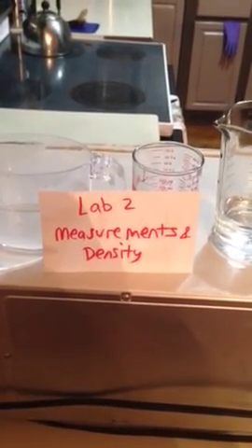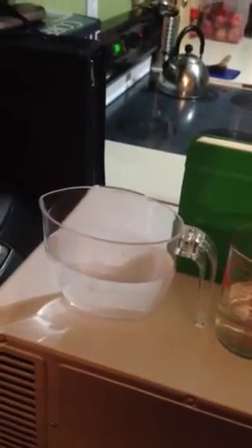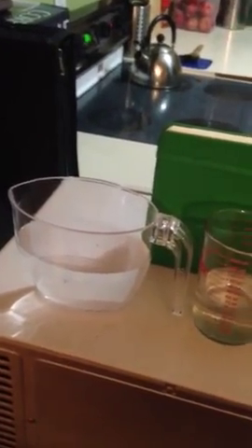Now part 2 of lab number 2 is determining volumes of water in 3 different measuring devices. So you're going to either randomly fill your containers or have someone that is near you fill the containers, not all the way, but somewhere within the measuring range. And you're going to look at each and take your best measurement, estimating to the proper place as described by your instrument. So let's start with the first one.